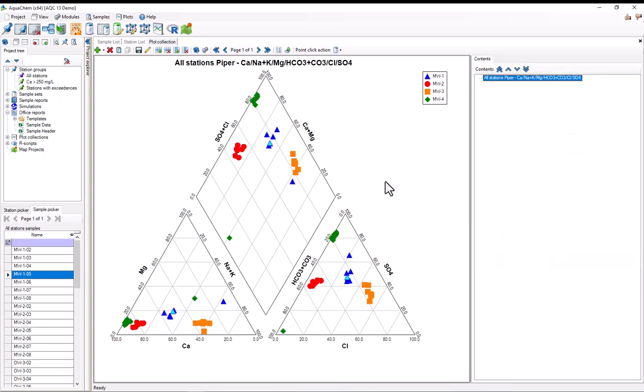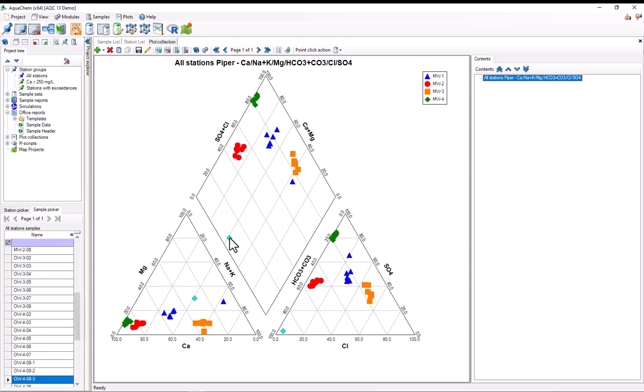If I close the settings, we can see that this plot is interactive. For example, most of the samples for the station MW4 have chemistries that put them in the calcium chloride type phases. But we can see that one sample has chemistry data that apparently puts it in the magnesium bicarbonate phases. If I select it, we can see that it's highlighted on all three parts of the plot, as well as in the sample picker. And by looking at the sample picker, we can see that this sample is OW4-083.